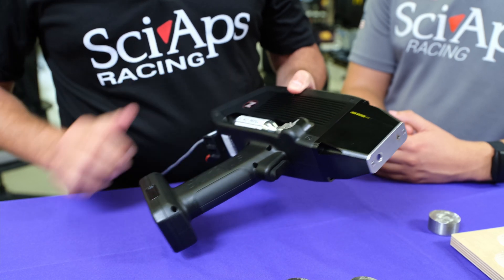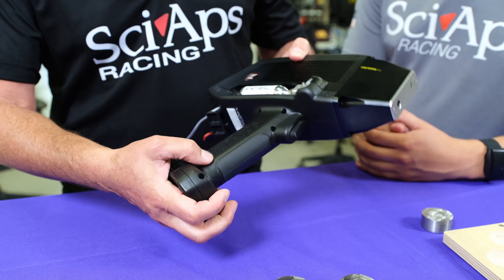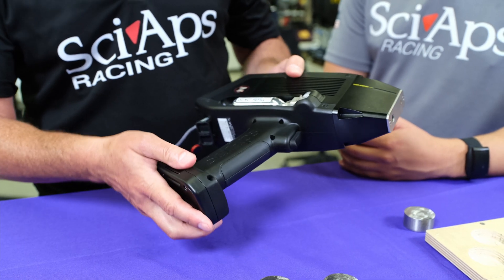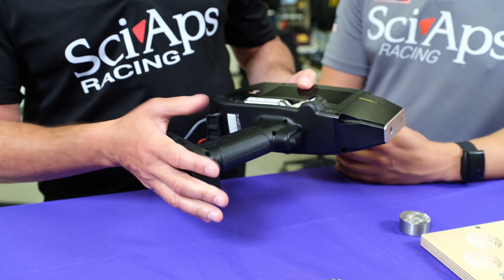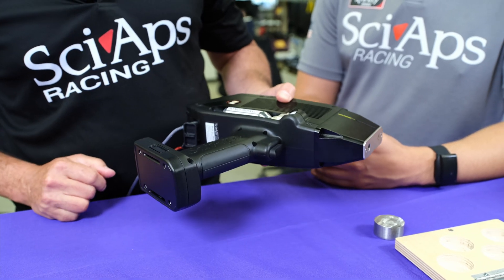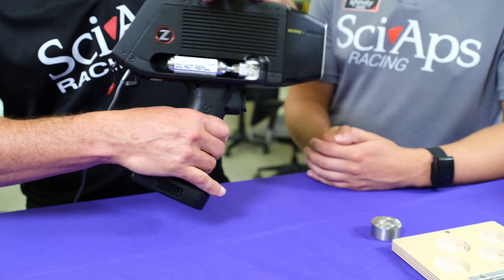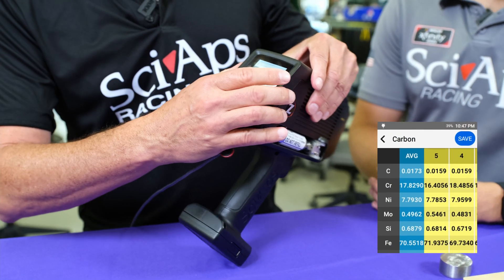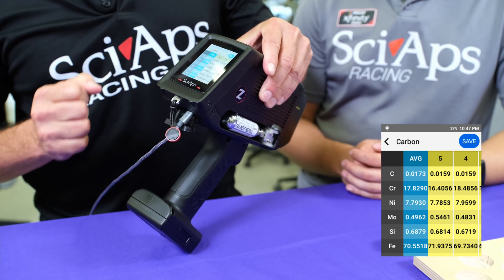The battery is down on the handle. We made the battery smaller, but it's also the same battery used on our X-ray gun. So if you have both our X-ray and our LIBS, the batteries and accessories are all interchangeable — a true one-box application. We also made the display on the rear, with a really nice color display that's easily visible when you're holding the unit.